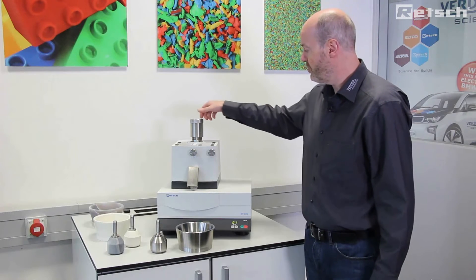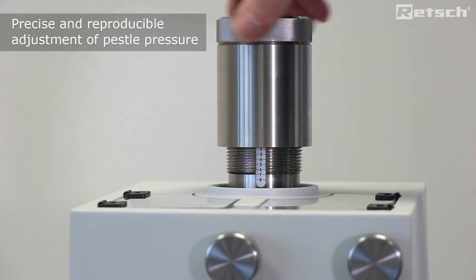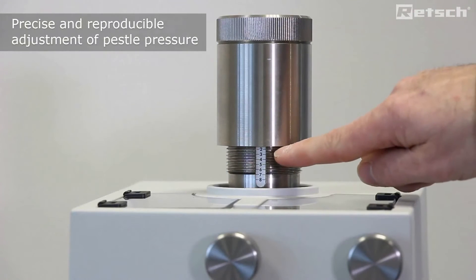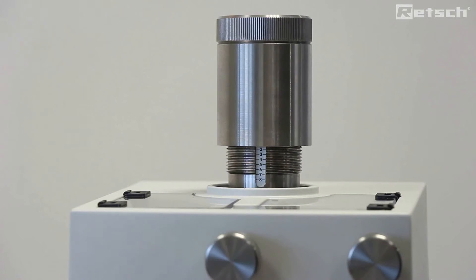To ensure reproducible results, we can adjust the pestle pressure according to a scale from zero to eight, where zero is the pestle operating under its own pressure.